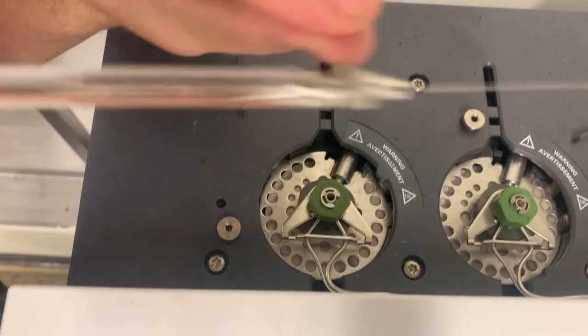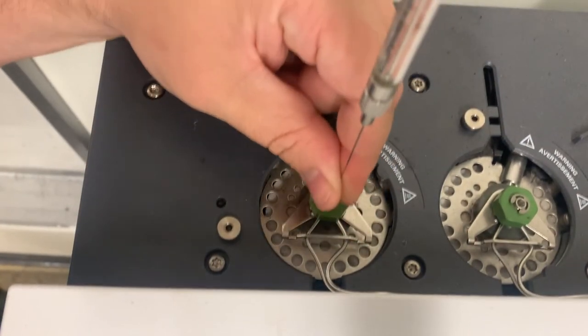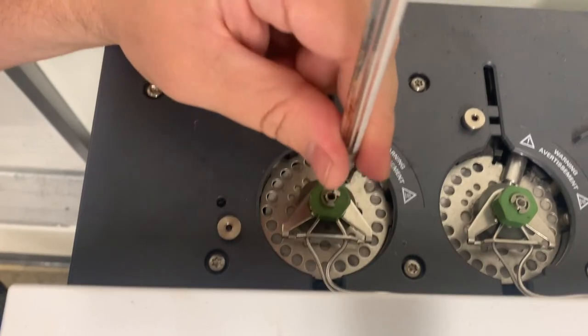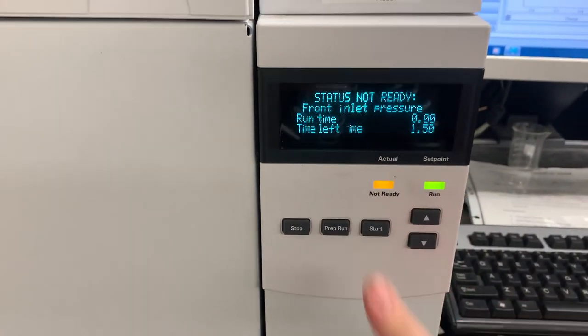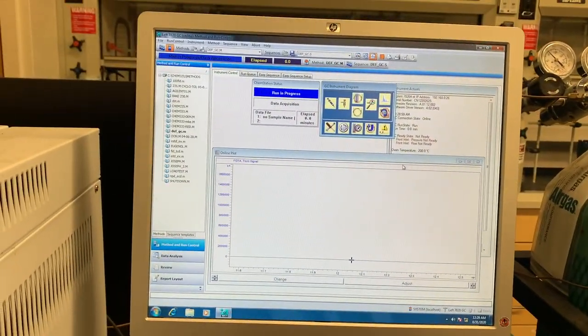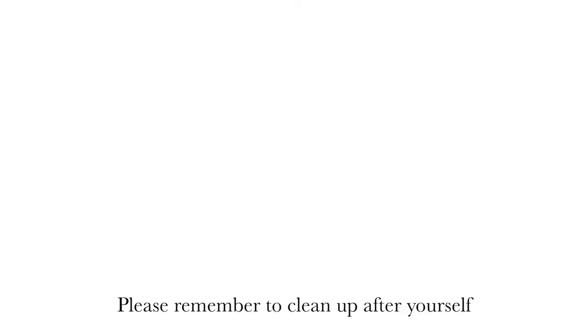So for this, you want to take your syringe, grab that needle, and guide it in, and then slowly push it in. Then depress the plunger all at once, out, back to here, and start. Once we have our chromatogram, we can print. And that's it. You're done.